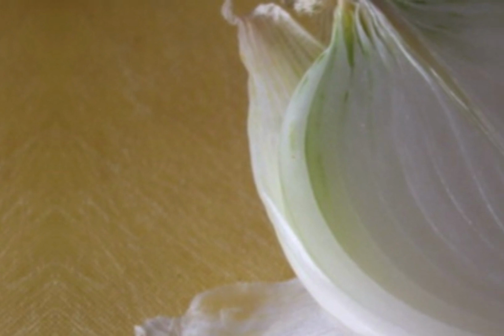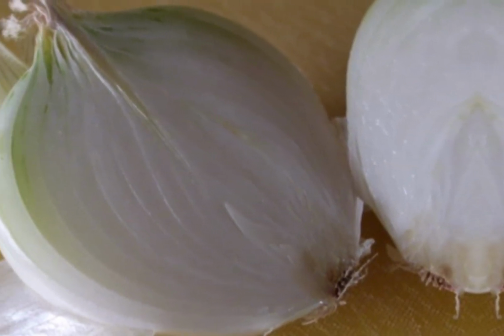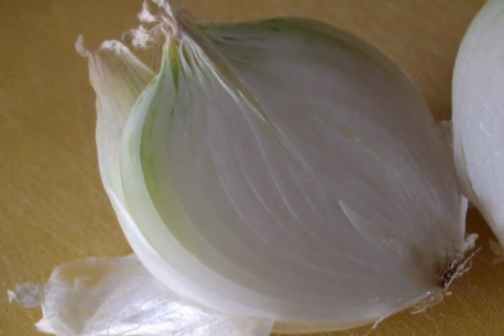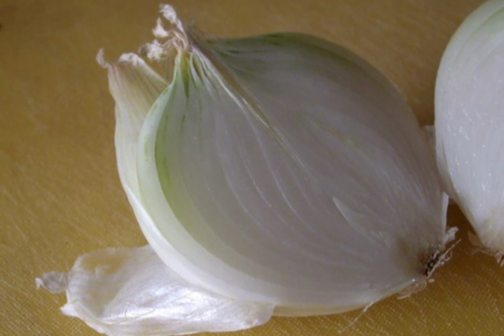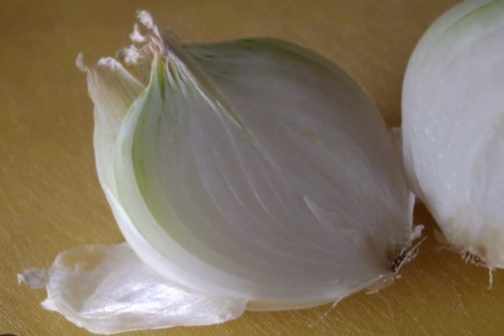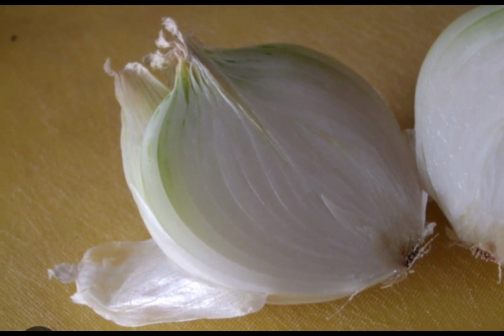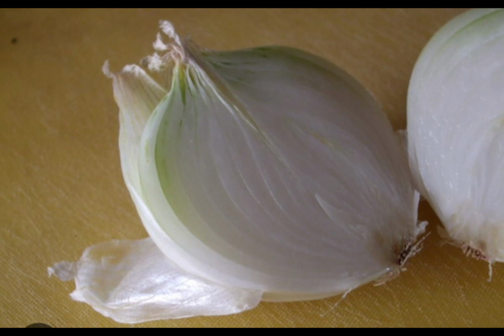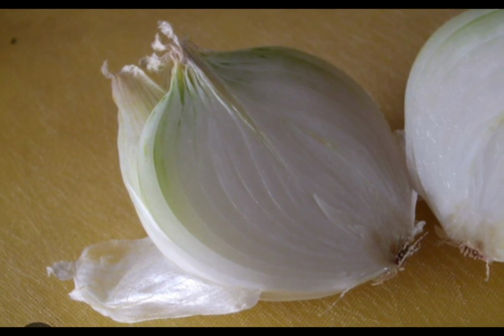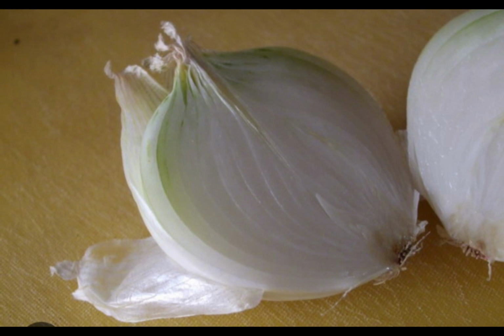The bulb of an onion is formed from modified leaves. While photosynthesis takes place in leaves of onion containing chloroplast, the little glucose that is produced from this process is converted to starch and stored in the bulb. It is very important to know the equipment that is needed for that practical and understand their roles.